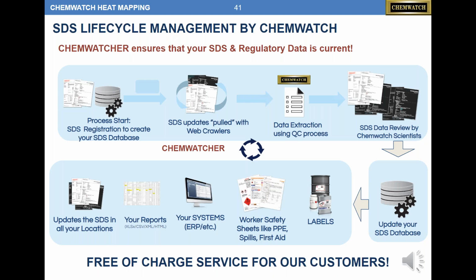So let me explain that, but I'll start off with this slide where we basically input your vendor SDSs into our system. Whether we find the vendor SDS or another user finds it via a crowdsourced model, we get your vendor SDS in the system. And if you find that we don't have one, you can submit it yourself.